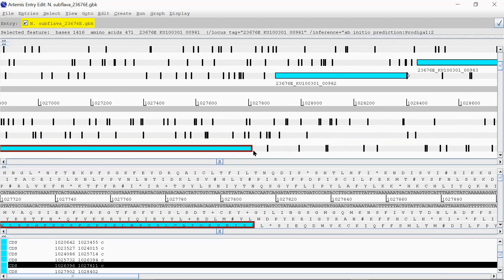So I talked about it before. I couldn't find any other start codons that were in this reading frame. So I'm assuming that the GTG is the correct start codon.